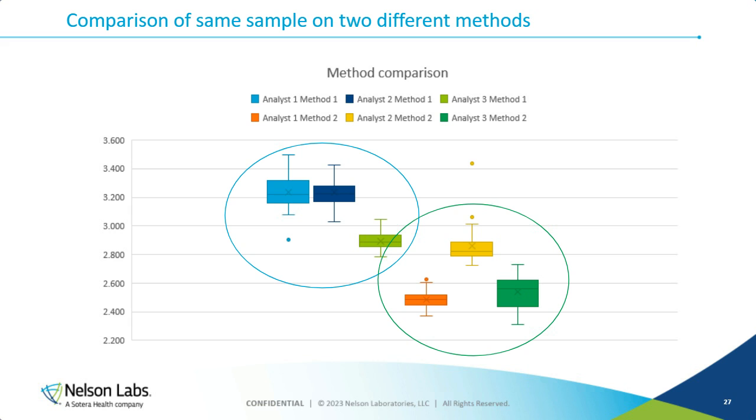And you can see that changing that one little timing step changes my average from being about 3.2 to being about 2.6, 2.7. It's not a matter of the parts getting leaky or less leaky. It's just the flow values changing by changing that one timing step.